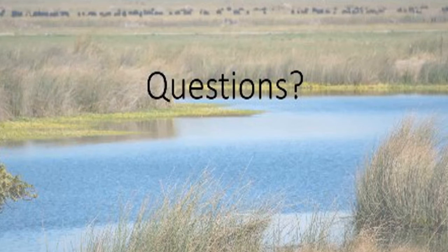I would say that's a tough one, and we're always in consideration of potential false positives and false negatives, and so all the best practice techniques, as Sarah was just mentioning: sterile technique, replicability, sampling at different time points in a year, making sure that there's no inhibitors present in your sample that give you a false sense of nothing being there.